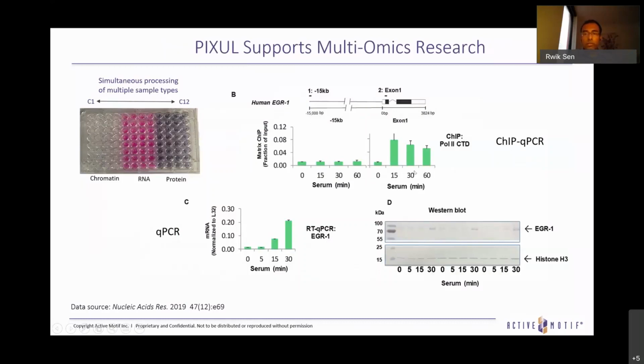You see a 30-minute signal, 30-minute signal, 30-minute protein. There is a difference between 15 and 30 versus from here to here, and we know that's because of the RNA polymerase 2 pausing before starting the transcription. So that's why there is a lag.